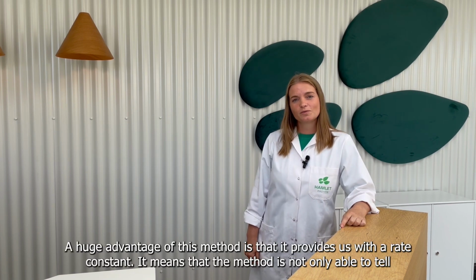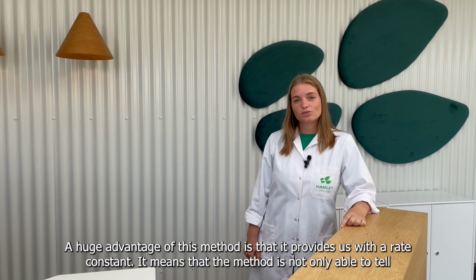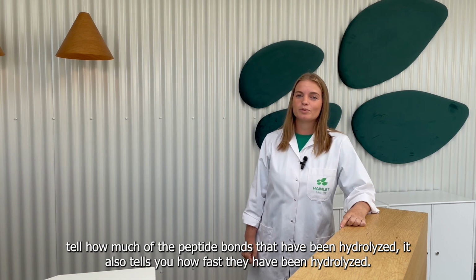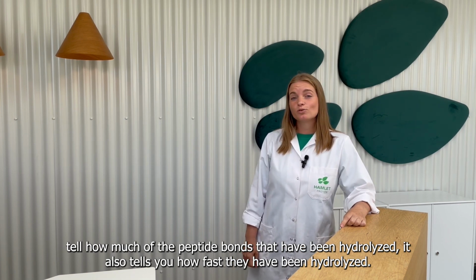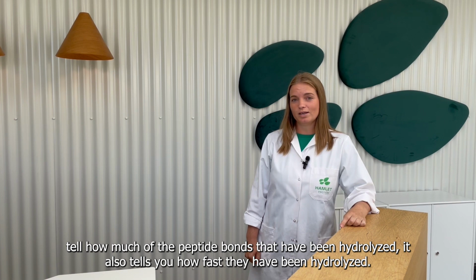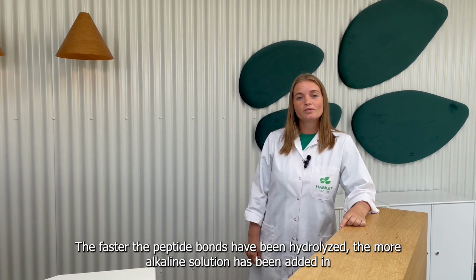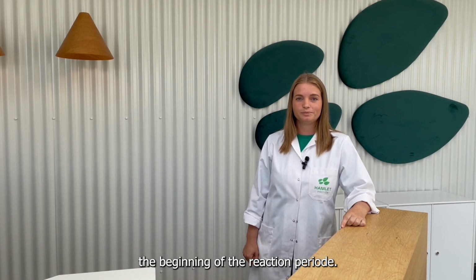A huge advantage of this method is that it provides you with a rate constant, and it means that the method is not only able to tell you how many of the peptide bonds have been hydrolyzed, it also tells you how fast they have been hydrolyzed. The faster the protein hydrolysis, the more of the alkaline solution has been added in the beginning of the reaction period.